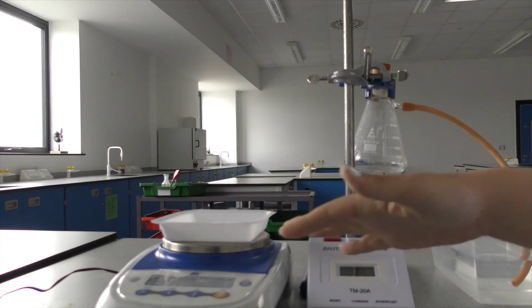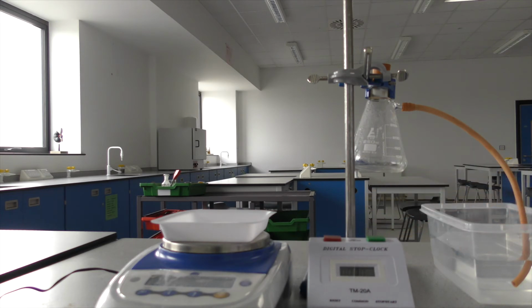So this says 6.04. Now with your large chips, it's going to be really hard to get it exact, but we need to make sure that all of the masses are roughly about 6 grams, okay, because this is roughly about 6 grams.